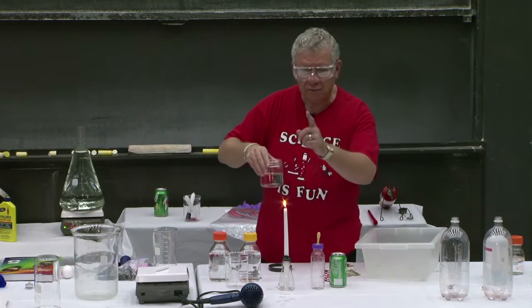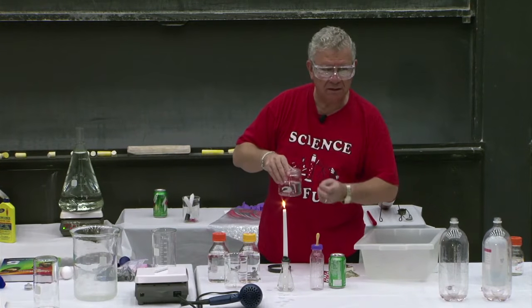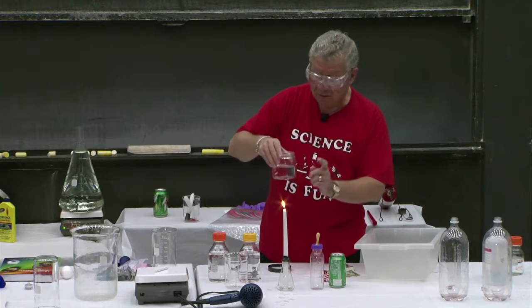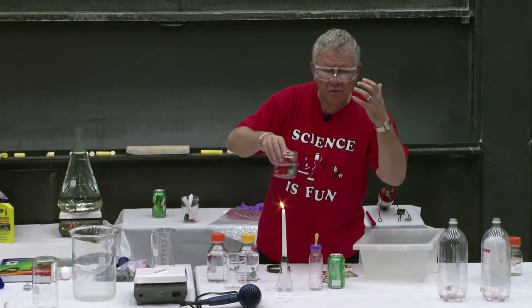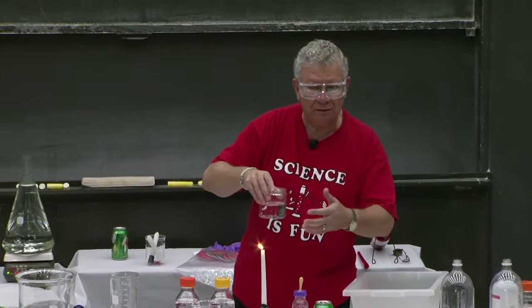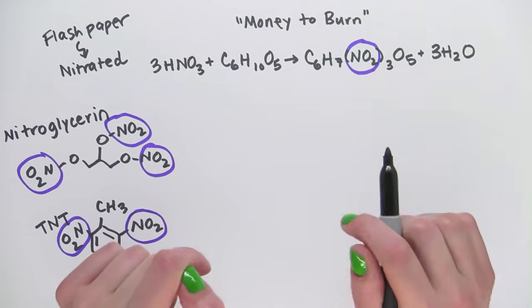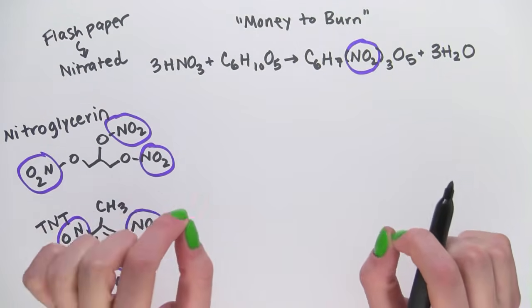You know also from experience that when you burn alcohol, what color flame do you see? It's kind of bluish, right? Do you remember what color flame you saw here? It was a little yellowish, right? That's because we also added a little bit of sodium chloride in there. The eye is more sensitive to the yellow color than it is to the blue color. So we added the sodium chloride to enhance the visibility of what's going on. All right, so what happened there? Dr. Shakhashiri soaked the money in a solution of water, rubbing alcohol, and a little bit of table salt.